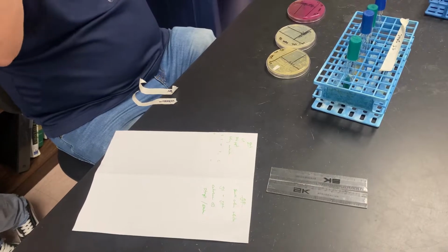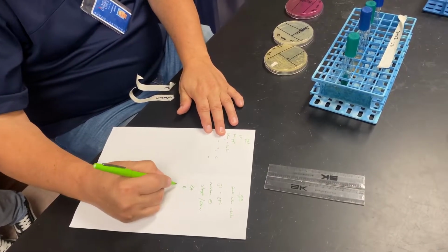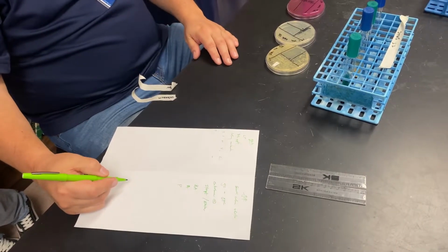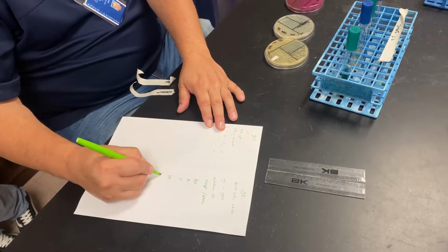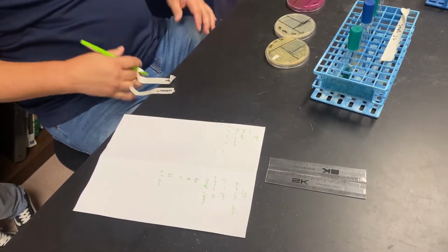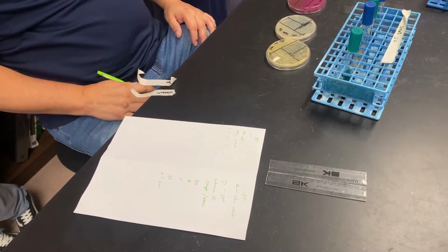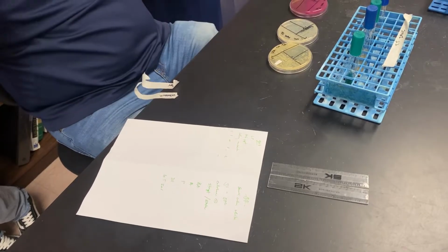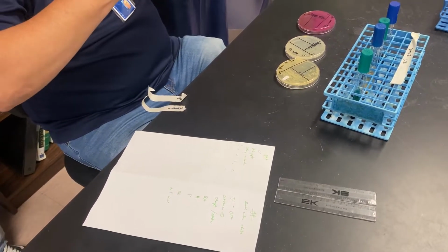So I'm thinking, well, I'm going to go ahead and do blood agar. I'm going to put an A and a P disc on that, right? And while I'm there, I might as well go ahead and do bile esculin and 6.5 salt tolerance. I'm done. All I have to do is collect answers. How easy is this, huh? What about gram-positive rods? A whole different ballgame there. So you have to look at the one that says gram-positive rod.